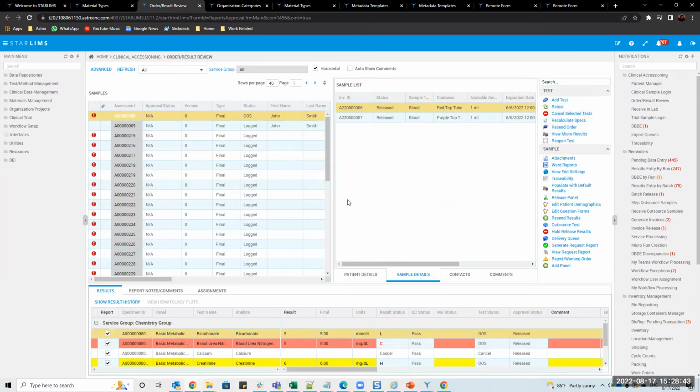The way this was written, it's not waiting for all of this to come back. It's actually loading it in separate sections, because obviously the data here depends on this data. So it doesn't make sense to load this and then load this in parallel. There is a sequential mechanism to it, but you don't have to wait for all of it to show it.